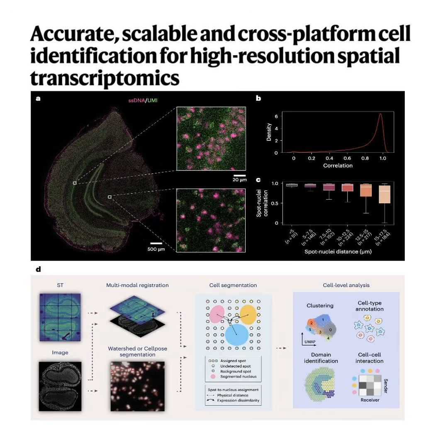Right. And Cellist showed minimal transcript contamination, but mathematical purity isn't enough. It has to make the biology clearer. Biological interpretability. They compared Cellist's output to standard single-cell RNA-seq references. Yes, and Cellist had the highest concordance and the highest marker specificity, which they measure using log2 fold change. Log2 fold change. That's essentially taking the logarithm of the ratio of a gene's expression inside the segmented cell versus outside it. Correct. It proves that Cellist is successfully separating mixed signals. If it says a cluster is a neuron, the RNA inside perfectly matches known neuron markers, separated entirely from the blurry noise of adjacent cells. Okay, so it's mathematically better and biologically accurate.